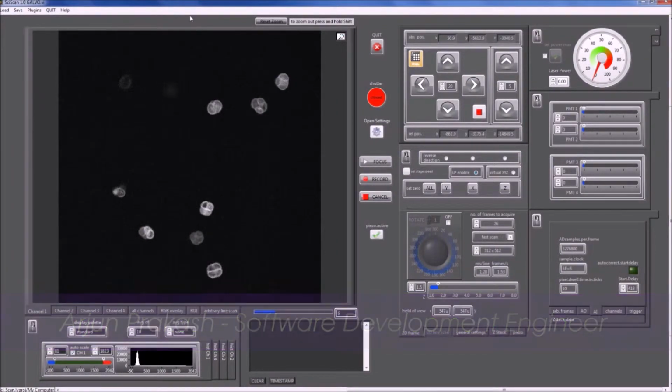The Position Save module is an add-on module to the open source SciScan software and lets you save positions of interest in the sample you are imaging. This lets you come back to the same positions of interest at a later point of time.